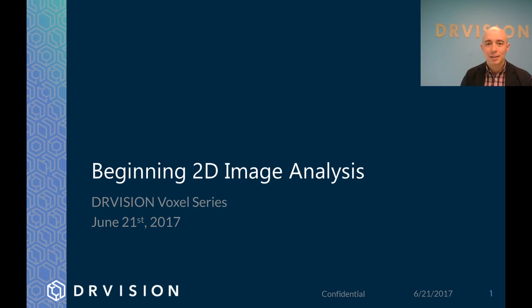I handle the technical and application support here at DR Vision, and I'm going to be your host today. We're going to take a look at some real fluorescence microscopy data, and we'll take a look at some of the challenges and approaches to analyzing this data.